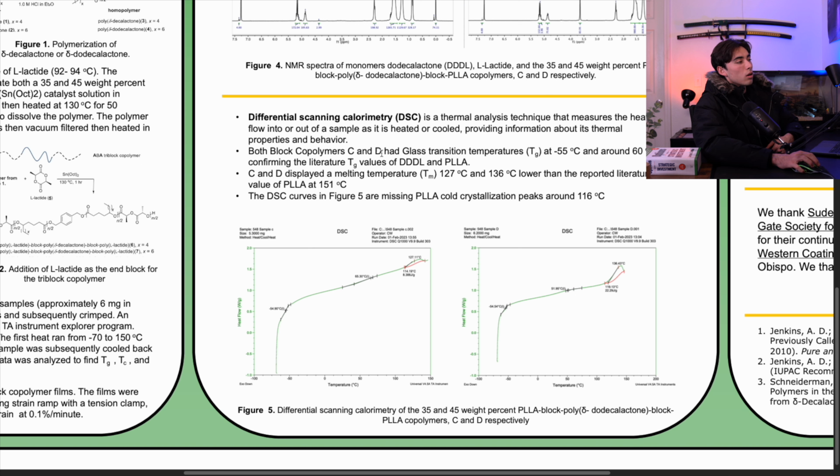So here are our DSC graphs. DSC stands for differential scanning calorimetry. It's a thermal analysis technique which measures the heat flow in or out of a sample as it is heated and cooled, which gives us information about its thermal properties and behaviors.